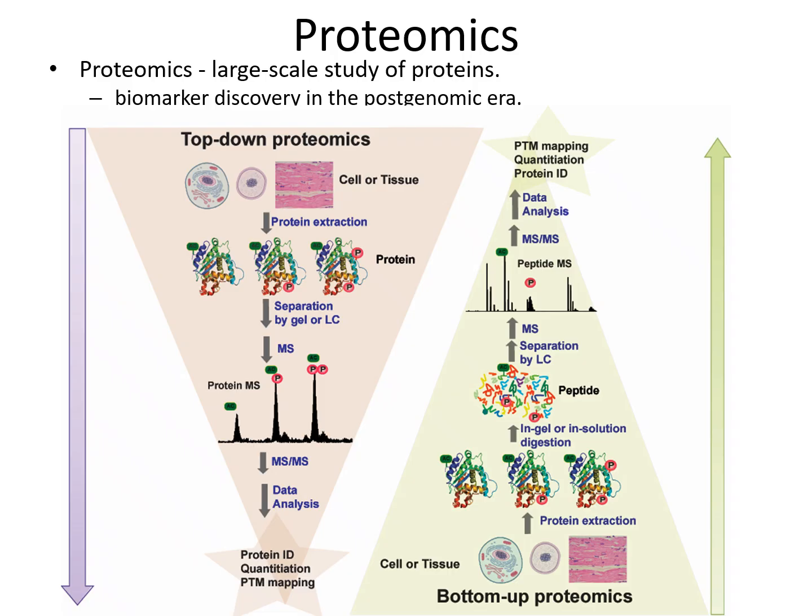And then also we have this top-down approach. On the left side, you can see the top-down proteomics. So you have the cell, collect cell tissue, then you extract the protein. So the whole intact protein is analyzed. And that simplifies the sample preparation and reduces the mixture complexity, as no proteolytic digestion is required. And then subsequently, the specific protein of interest can be gas phase purified, and modification sites can be mapped by tandem mass spec strategy. And the top-down MS provides comprehensive sequence information for the whole protein by detecting all types of post-translational modification and sequence variants simultaneously in one spectrum without prior knowledge. So that's top-down proteomics. Okay, that's the difference between the top-down proteomics and the bottom-up proteomics.